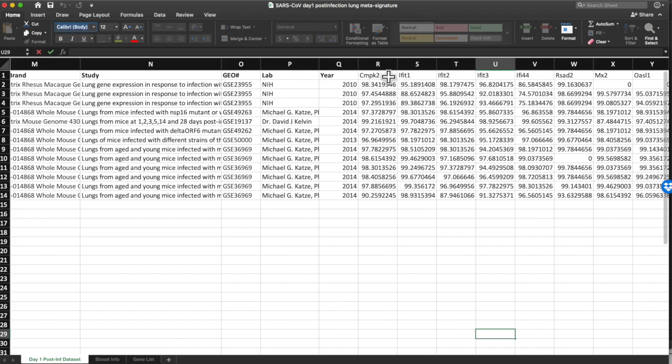As an example, you can see this first gene here, CMPK2. Based on the Illumina scores, we can tell that the magnitude of change was very, very high compared to all the other genes in these data sets. Not only that, but we can also tell that this went up, or increased, compared to our control levels. If these were negative, this would mean that there was a high magnitude of change below our control levels. It is this scaling system that allows us to compare all of these results in the same data set.